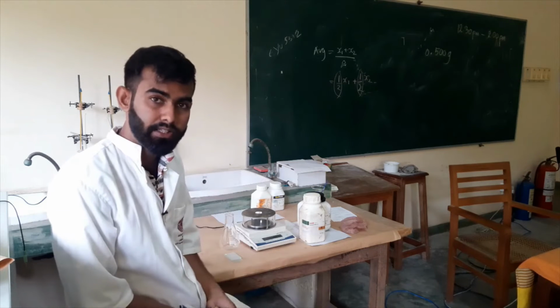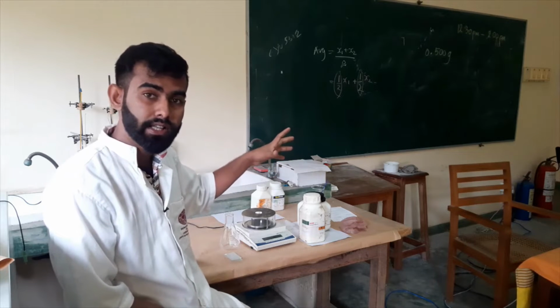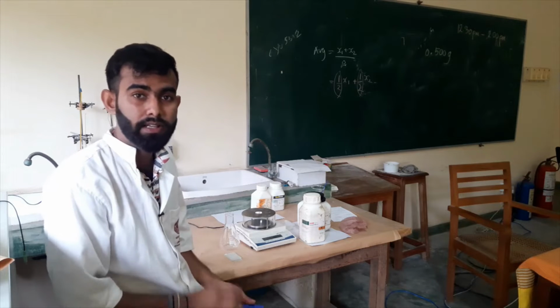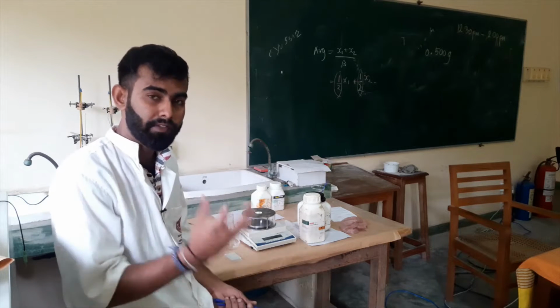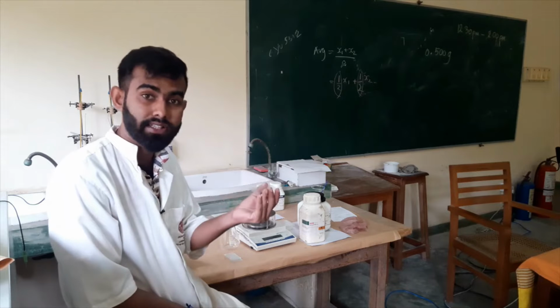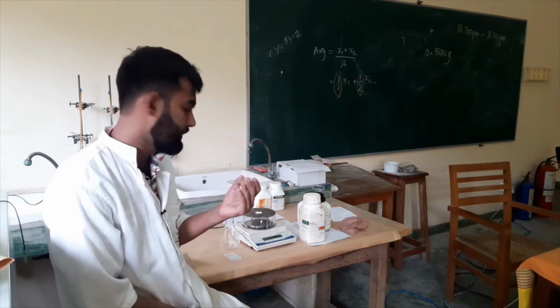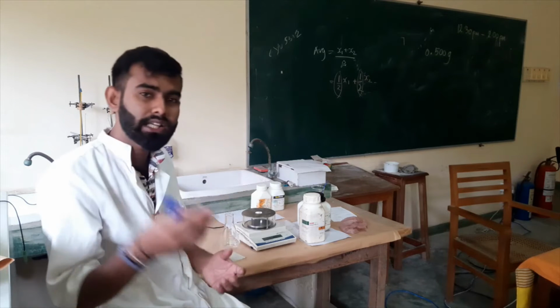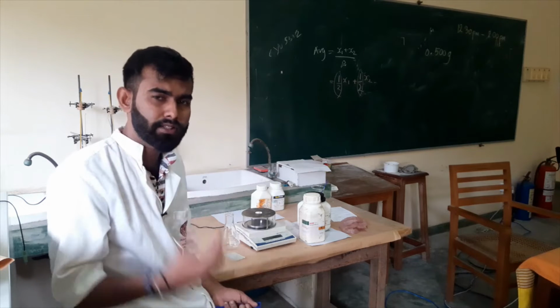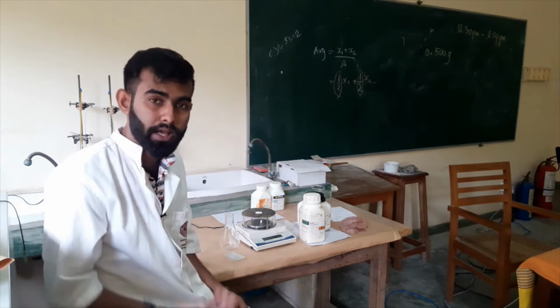When we prepare this TLC plate, we have to mix the same proportions of both silica gels, and add distilled water, mixing it very efficiently. After that, the resulting paste we will spread on these glass slides, and then we can oven dry those plates. That's somewhat interesting. In your organic chemistry practicals, we are not going to prepare TLC plates, but if you know the method of preparation, it is very important. So I'm going to teach you how to prepare a TLC plate.